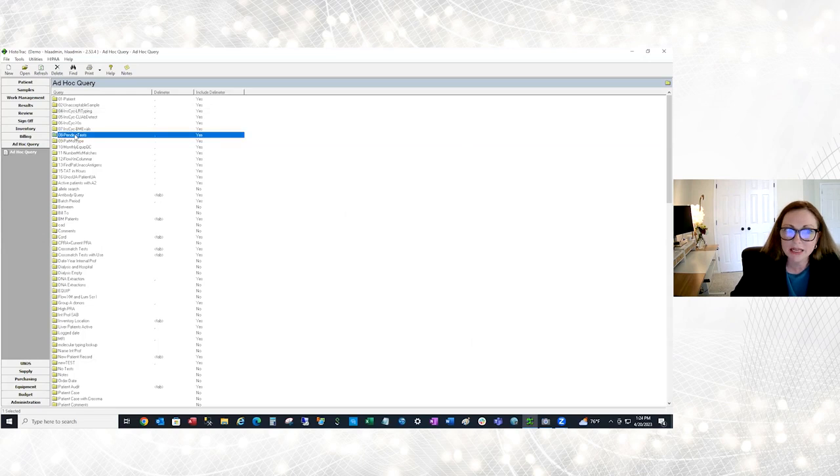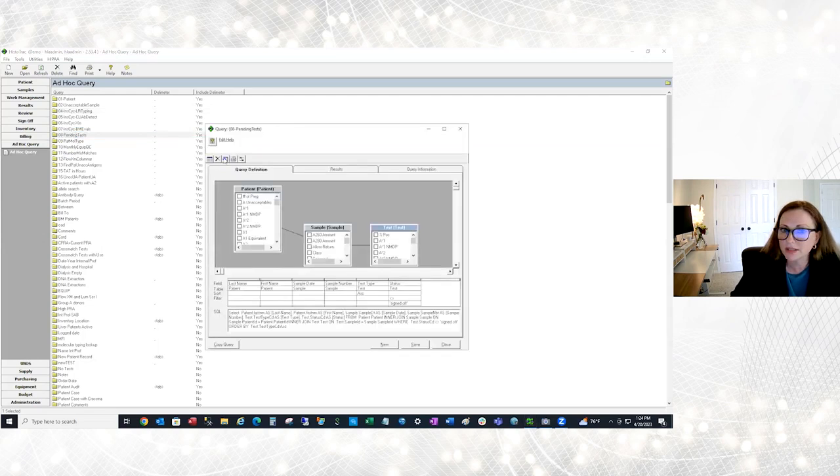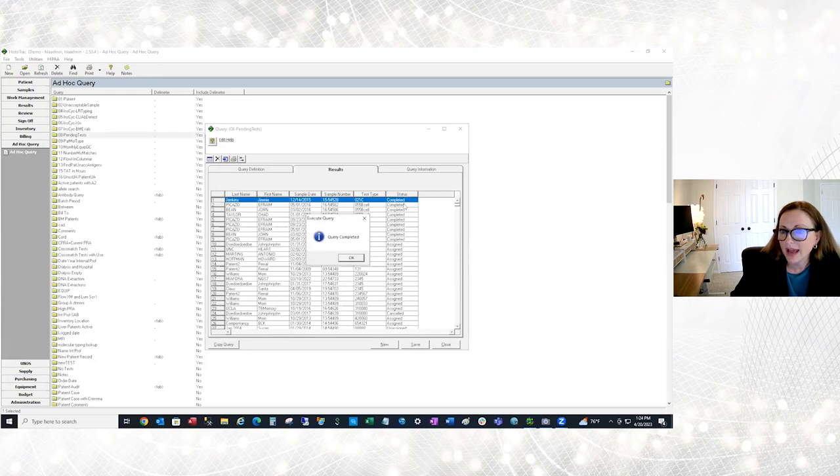You could run pending test queries. So if you needed to see, do I have a list of tests that are still waiting there that haven't been signed off? Maybe you need to go focus on getting these turned around so they don't go overdue on their turnaround time.